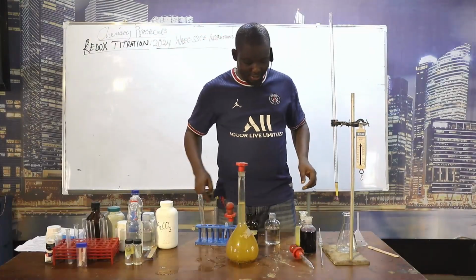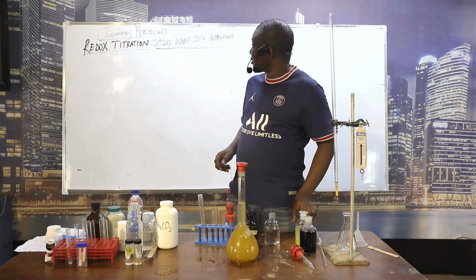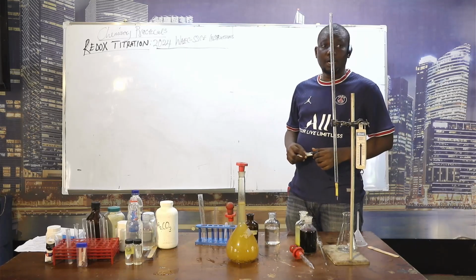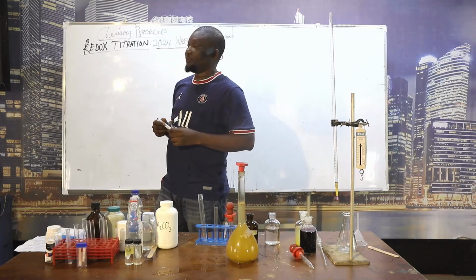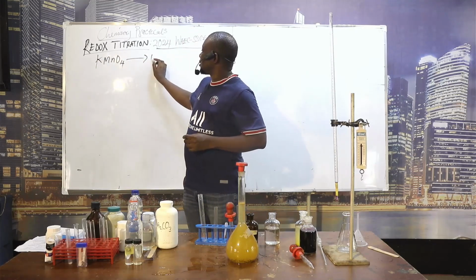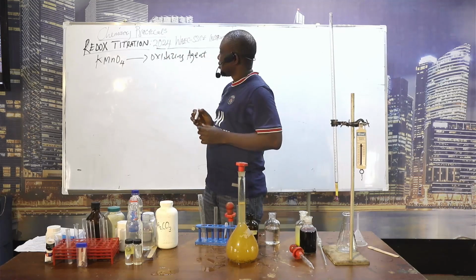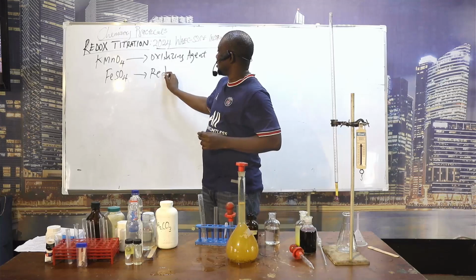Hi viewers and students, welcome to today's class on redox titration. So in today's video, we are going to be standardizing, or carrying out a titration between, a solution of KMnO4, which is an oxidizing agent, with iron(II) tetraoxosulfate(VI), which is a reducing agent.